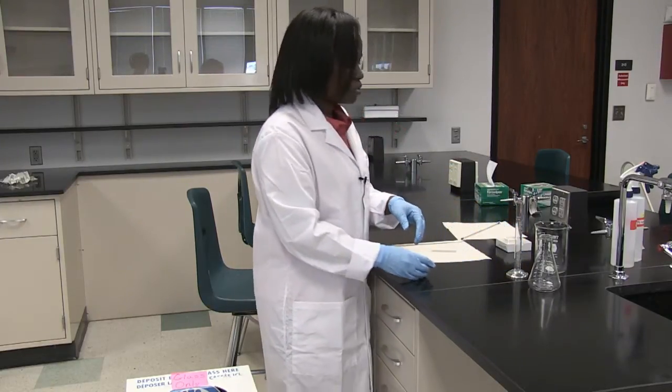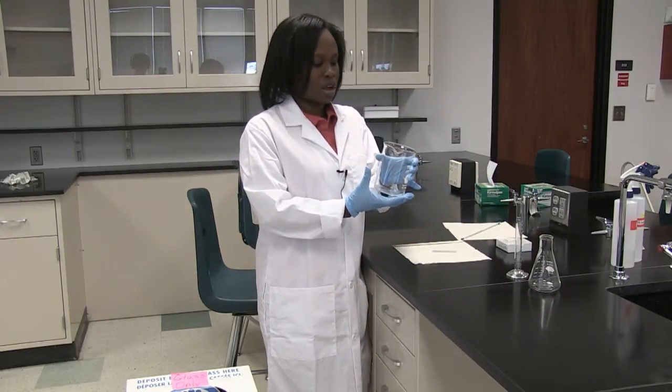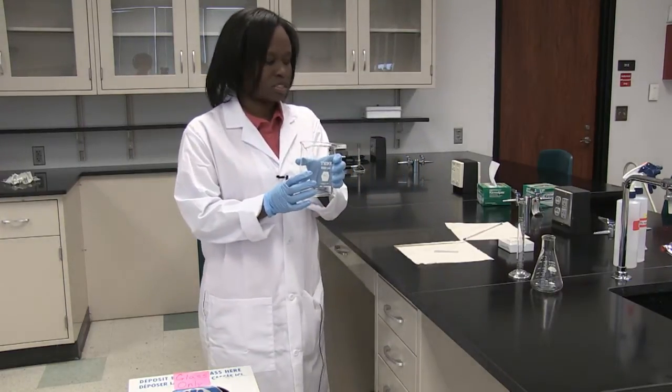When you're using your glassware, make sure — for example if you're boiling some water in a beaker — that you don't drastically change the temperature, because this could cause the glass to crack.